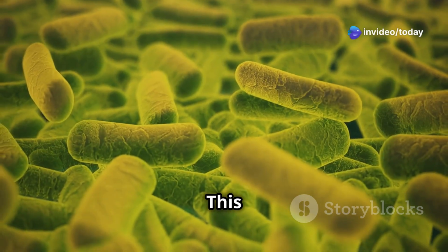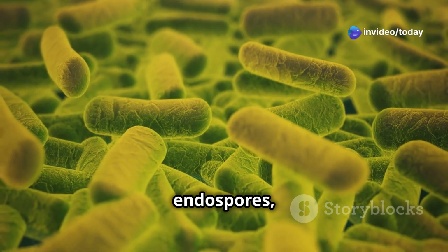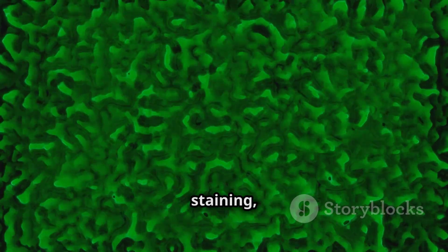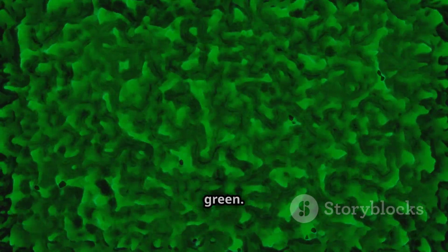Endospore stain. This technique is used to detect the presence of endospores, which are dormant structures formed by some bacteria. Endospores are resistant to staining, but they can be stained with malachite green.